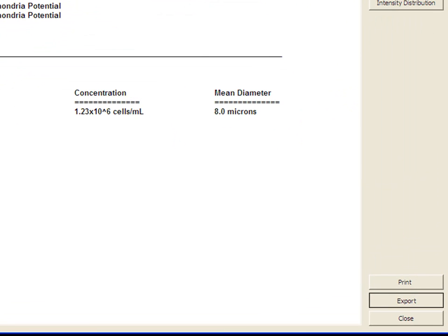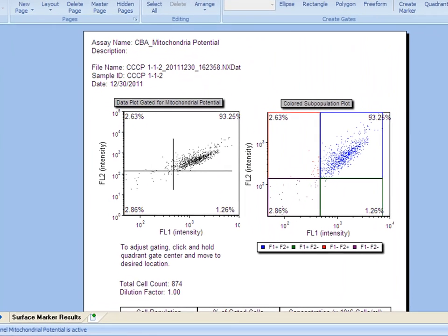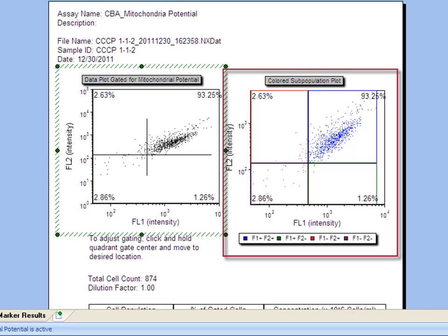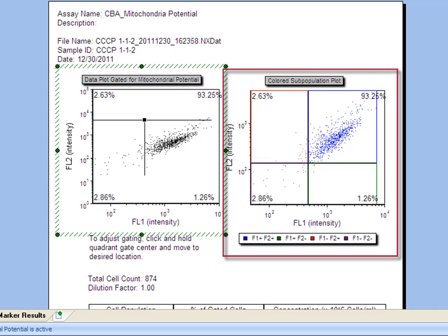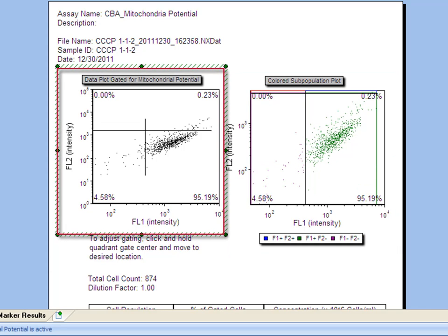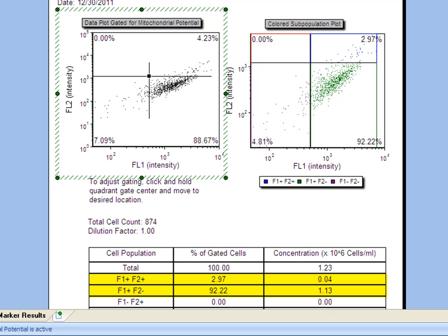The export function is used to generate results in the FCS Express 4 software using optimized Vision CBA data layouts. Mitochondrial membrane potential is displayed as a colorized scatter plot showing percent compromised and percent healthy cells based on red and green fluorescence. The gating can be manually optimized, and associated data tables update automatically to reflect revised percentages.